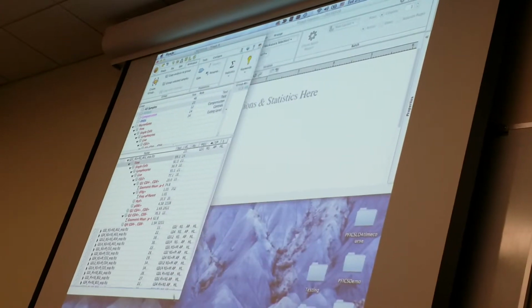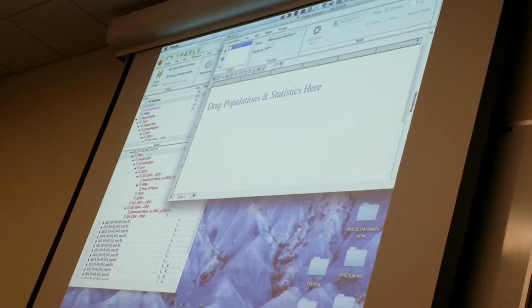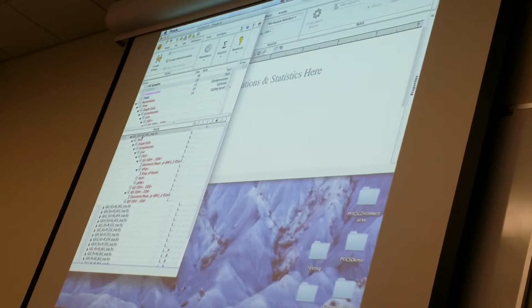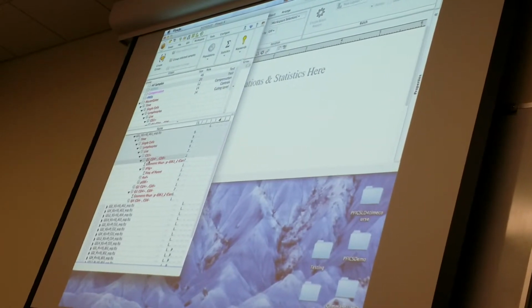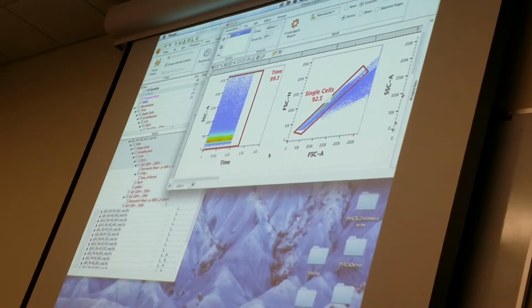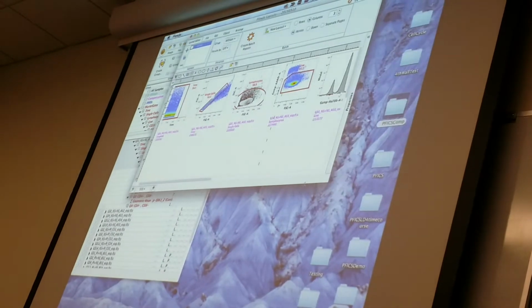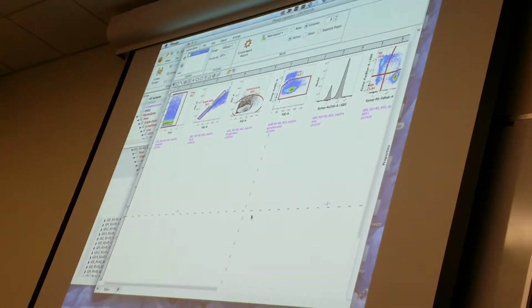Try and get some real estate here to work with. Okay. So first I'm just going to grab all of the information down to my CD8 positive T cell population. If I do that at one time, then it gives me these nice plots. I can zoom out and I can see the various plots and the way they're displayed.